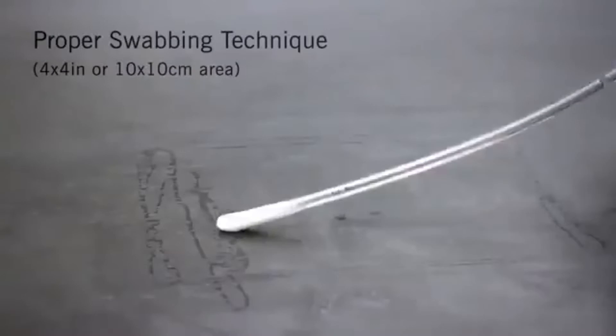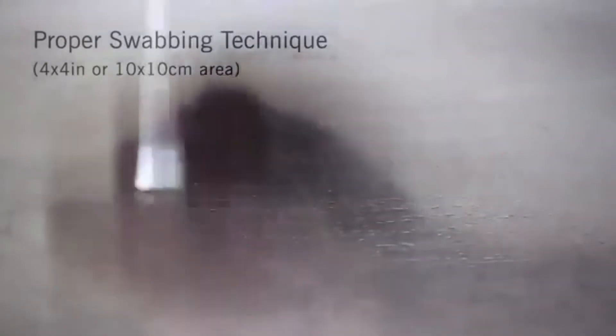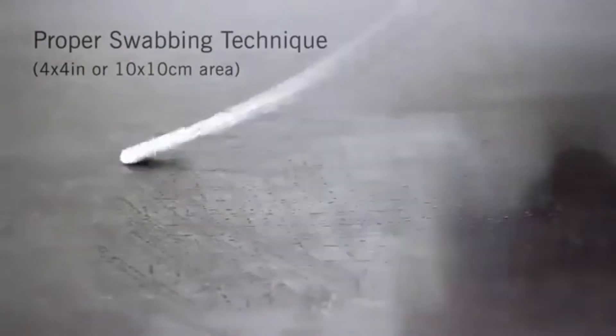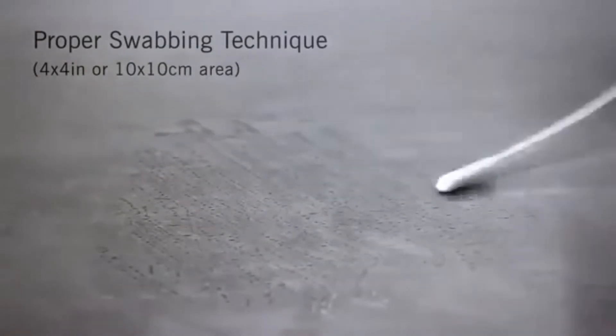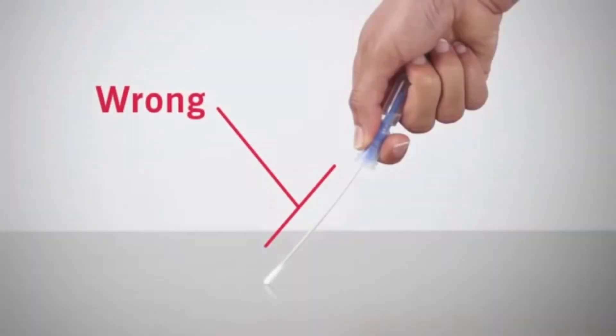Remove the swab from the tube. Swab a 4x4 inch or 10x10 cm square area in a criss-cross pattern, swabbing the area with even coverage. Apply sufficient pressure to maximize sample collection and improve the accuracy of test results.